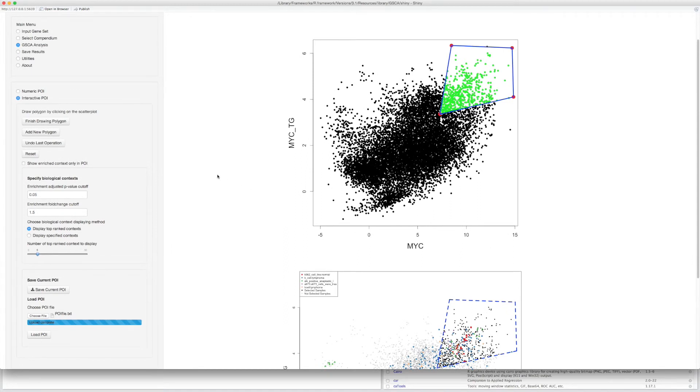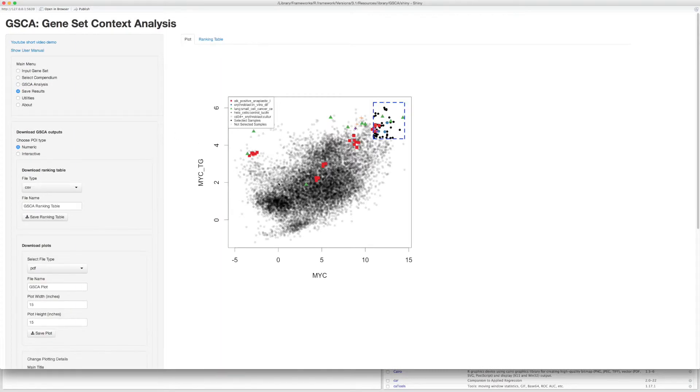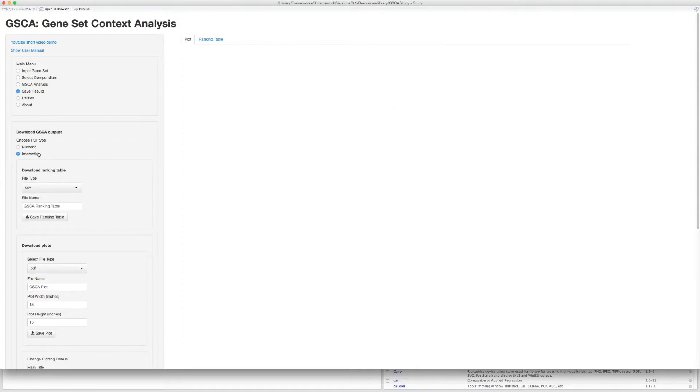After you have finished the GSCA analysis, you can go to the download step to customize and save all the outputs. You can choose to use the results from numerical or interactive POI.